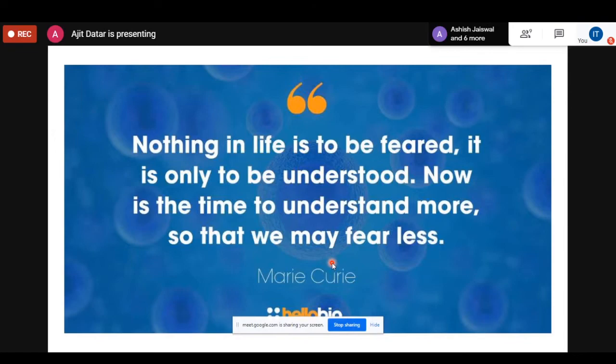And maybe we can reply to the participants again. One more from Nidhi actually. She wants to know whether there are any analytical techniques available that help differentiate bacterial strains and mutated types from wild types.